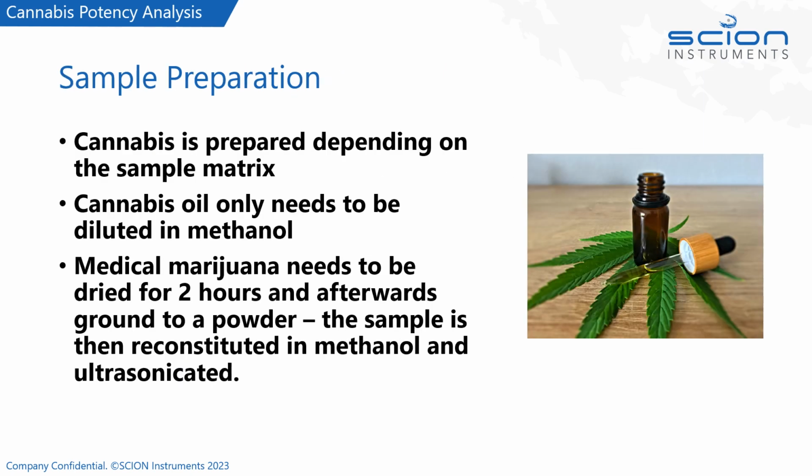Now, just to discuss sample preparation, just in brief. Now, sample preparation for cannabis analysis is absolutely crucial. So at SCION, we have tested both medicinal cannabis and cannabis oils. Now, the different sample matrices require different sample preparation techniques.